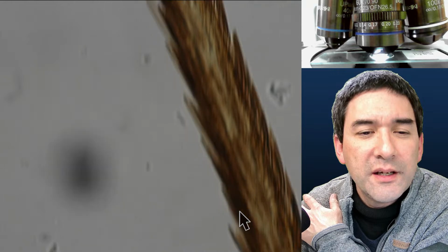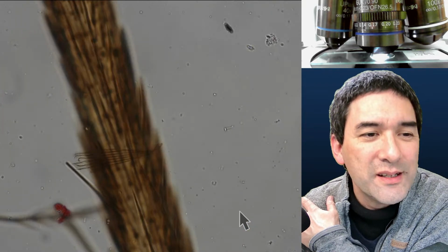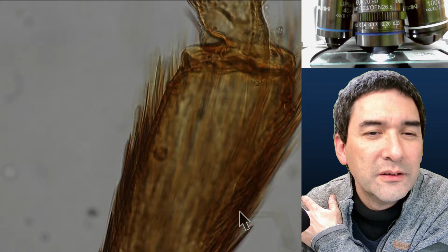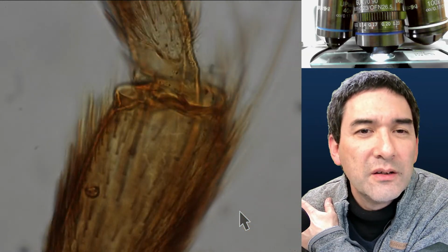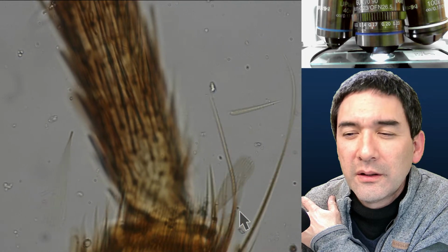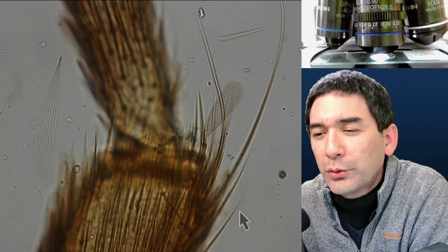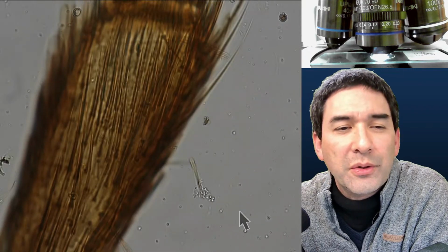There's been a request that I focus in on something here on the leg. This is huge, this thing. Look at this, lots of scales here. Okay, that's where the next leg segment joins in. Maybe this is the thing? Yes, these were spike protrusions on the lower parts. I've seen it on a lot of butterflies and moths too.